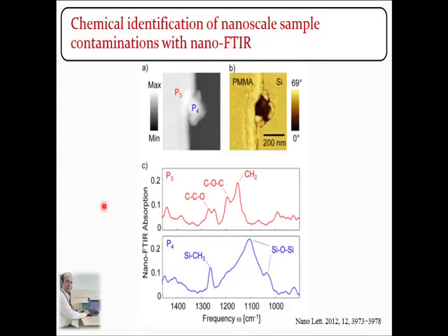Now let's have a look at the chemical identification of nanoscale sample contamination with nano-FTIR.